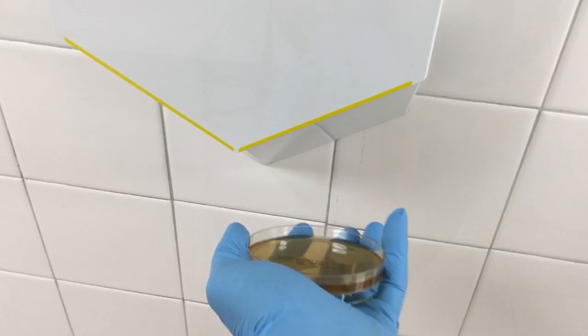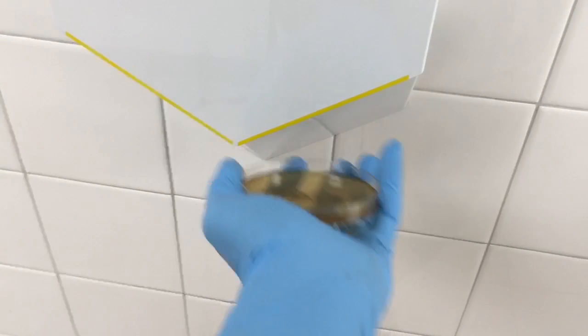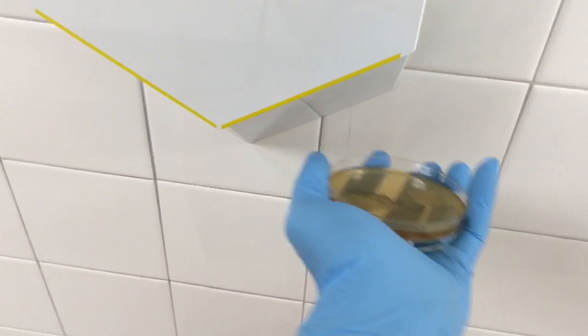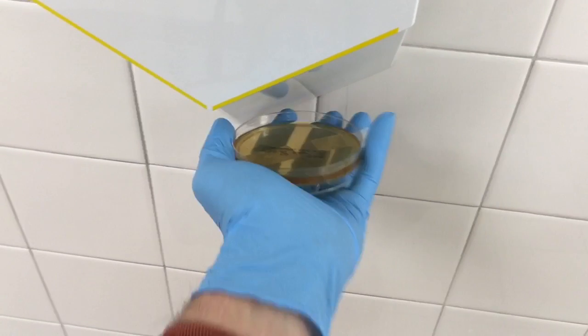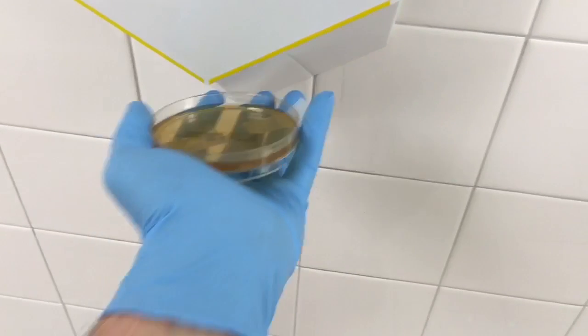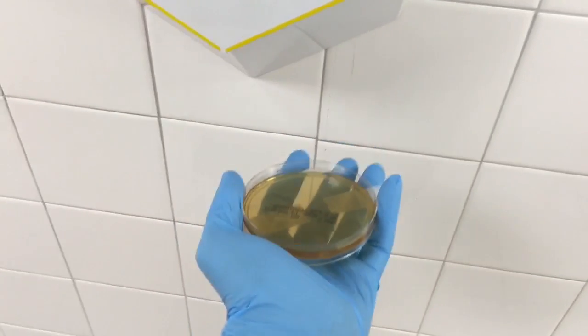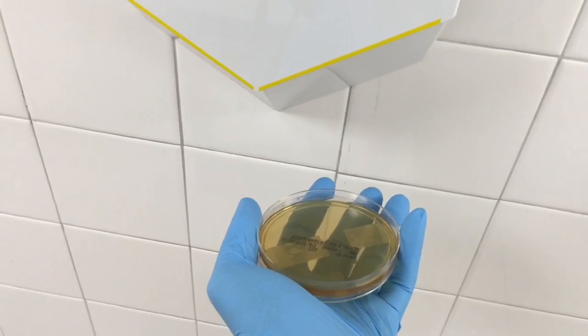On top of that, the high velocity air will aerosolize any liquids on your hands. And if you haven't washed your hands perfectly, any particles suspended within those droplets get spread throughout the room for everyone to touch and breathe. But I'm not here to criticize the Airblade. Let's move on to our results.